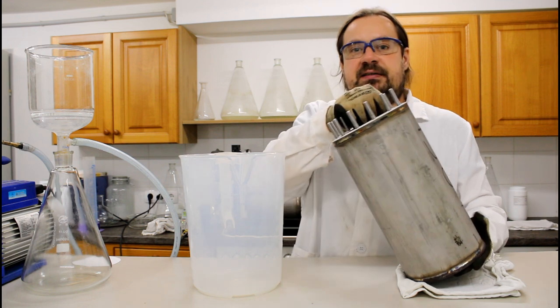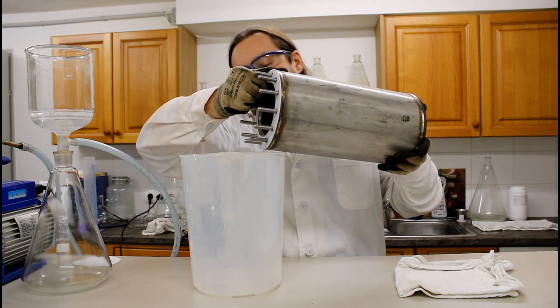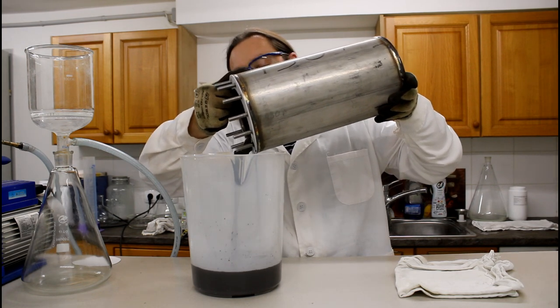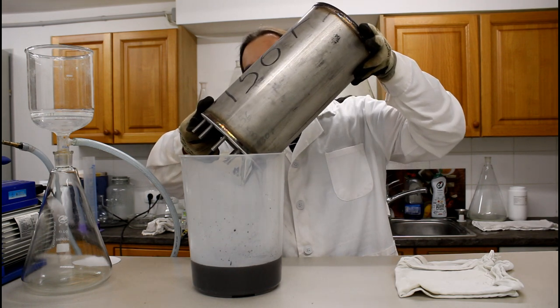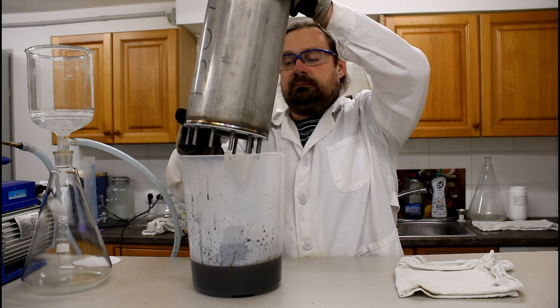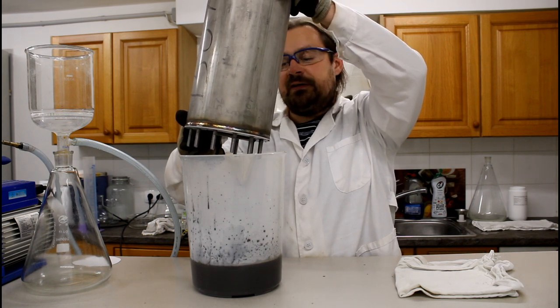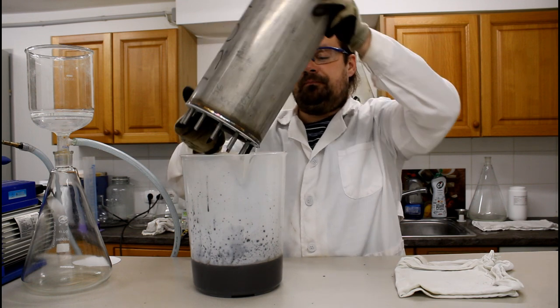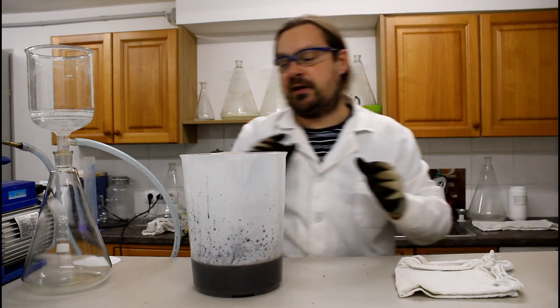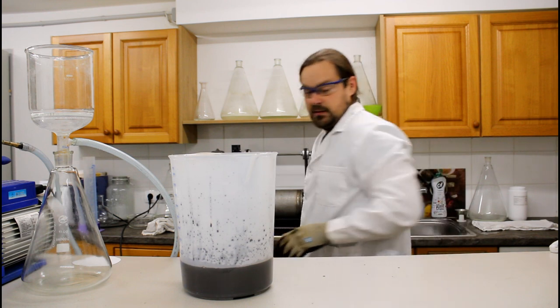Okay, now we have to be careful because that's still a very, very hot sodium hydroxide solution. So we're doing it slow. There we go. See, it's very dangerous because it's spitting out. But as long as you're wearing goggles, it's not so bad. If you get it on your skin, wash it off. If you get it in your eyes, you're having bad luck. Okay. So this is empty now. I set it aside. I'm going to wipe this away here.